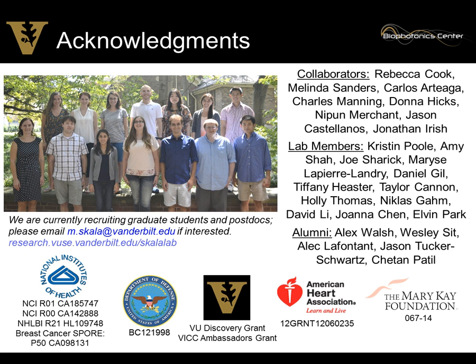For the xenografts, I think it depends on the model you're looking at. The xenografts are pretty homogeneous, but as you saw, the knockout models are more heterogeneous. And we just hope we capture enough of the tissue to capture the heterogeneity present. We're looking at single cells. We want to look at all the cells. Eventually, I want to look at all the cells in the whole tumor.